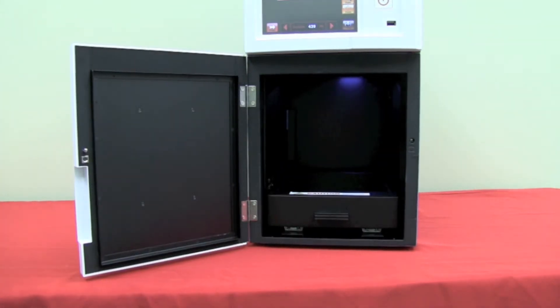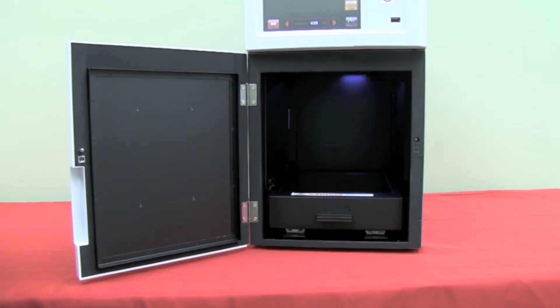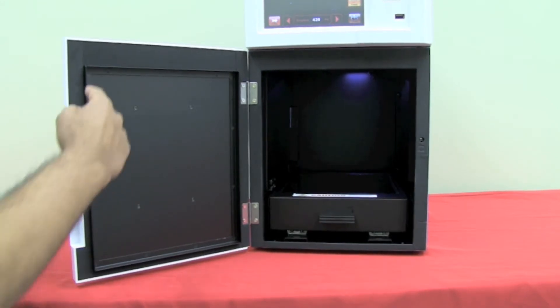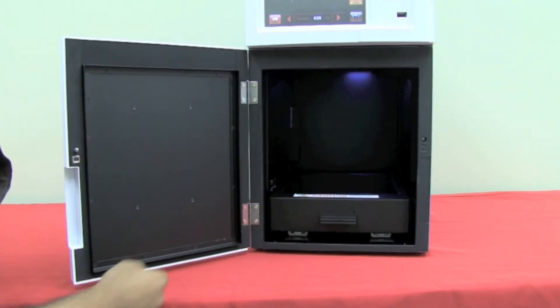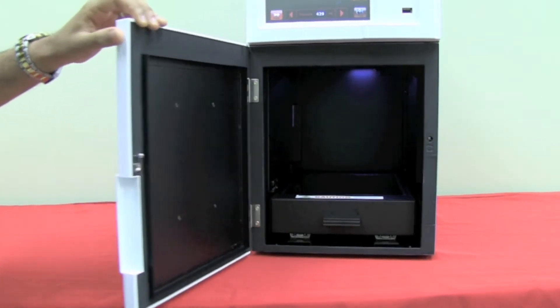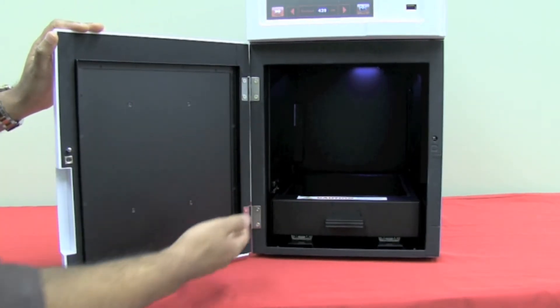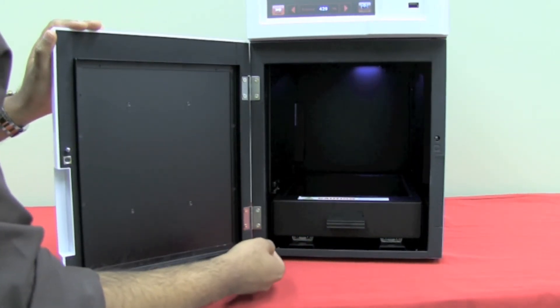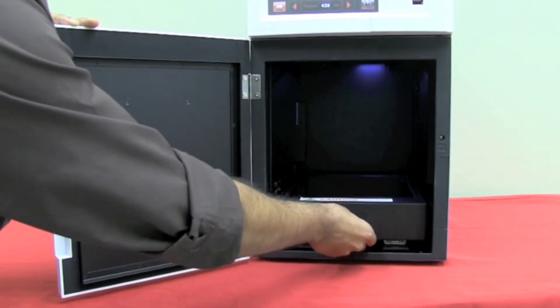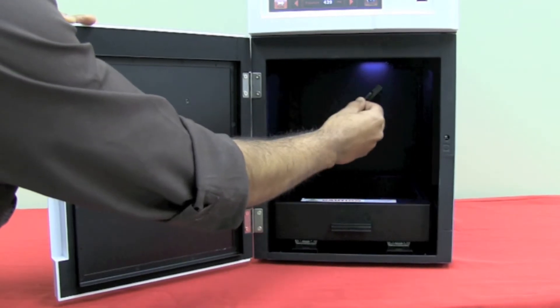By opening the door of the instrument, we can take a look inside the darkroom. The darkroom is designed to minimize the amount of light coming in. This is achieved with these seals here, and also the entire build of the instrument complements this. You can see the door is very sturdy here. The materials used are also very robust. We can see the transluminating table here and also the white light table just above here.